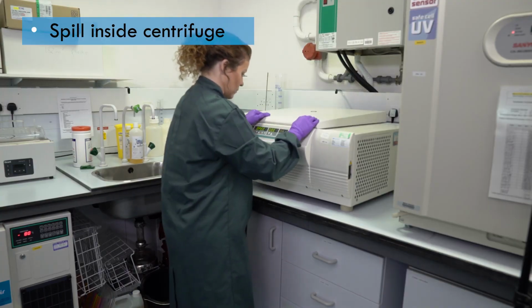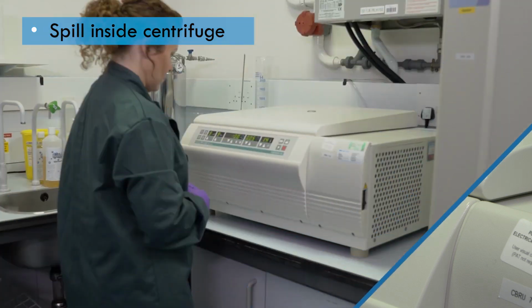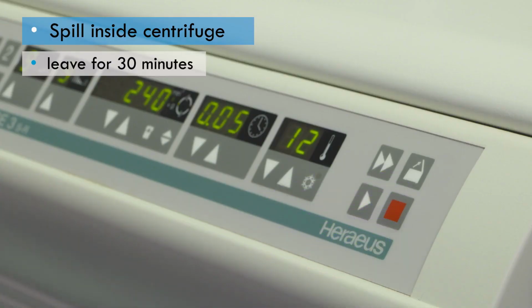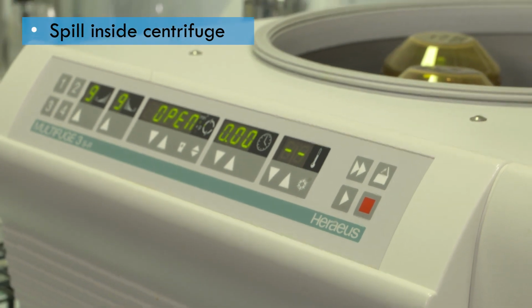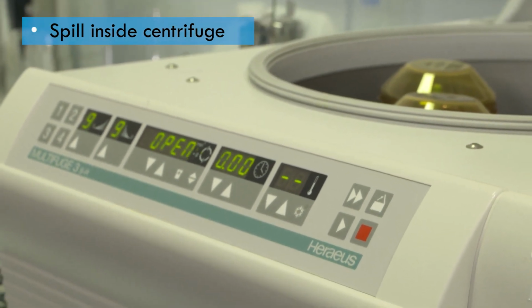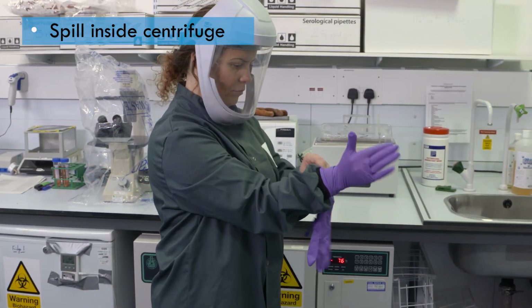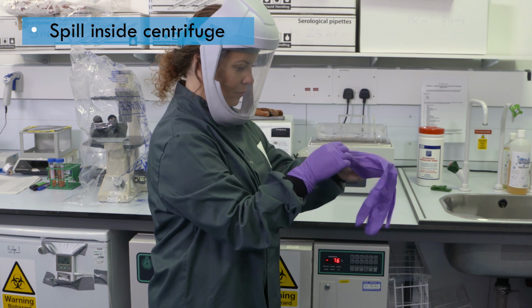If this happens, you should follow manufacturer's instructions, but the general procedure would be: stop the machine immediately and leave it for at least 30 minutes to allow any aerosols inside the machine to settle. Put on appropriate PPE. If there is a transparent lid on the centrifuge and you can see that the sealed buckets or rotor are not damaged, then lab coat, gloves and eye protection will be enough.